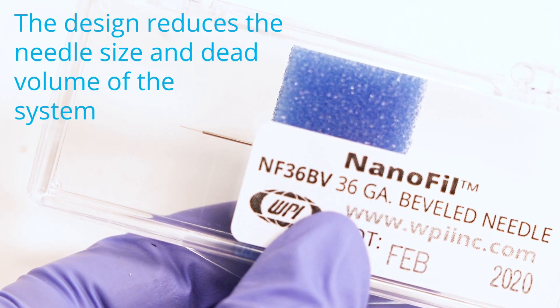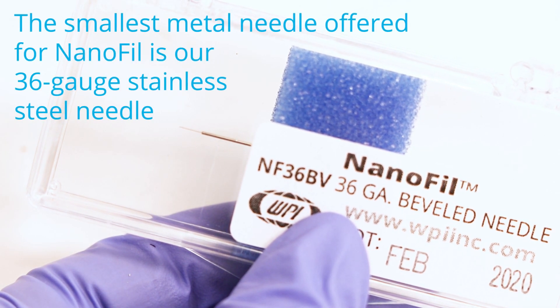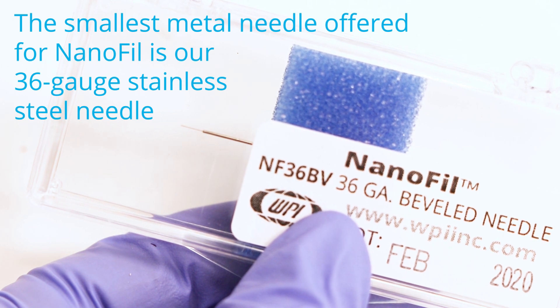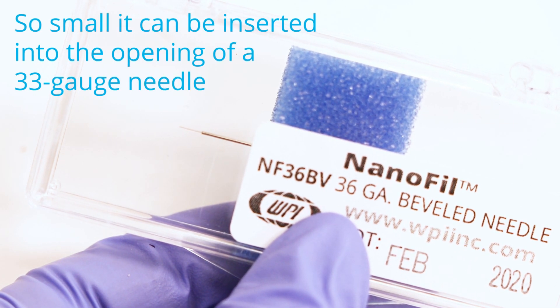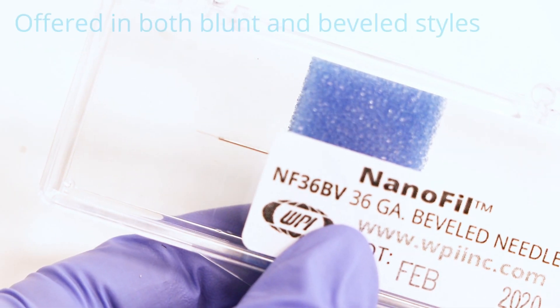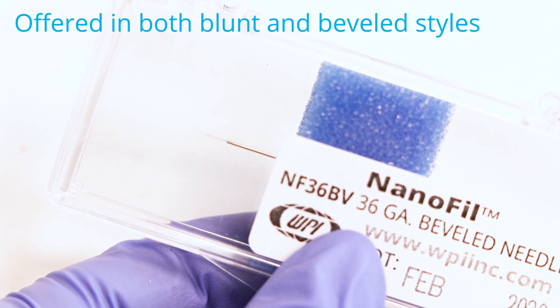The design of the needle reduces the needle size and the dead volume of the system. The smallest metal needle offered for Nanofil is our 36 gauge stainless steel needle, which is so small that it can be inserted into the 33 gauge needle. That's what you're looking at here, and it is offered in both beveled and blunt styles.